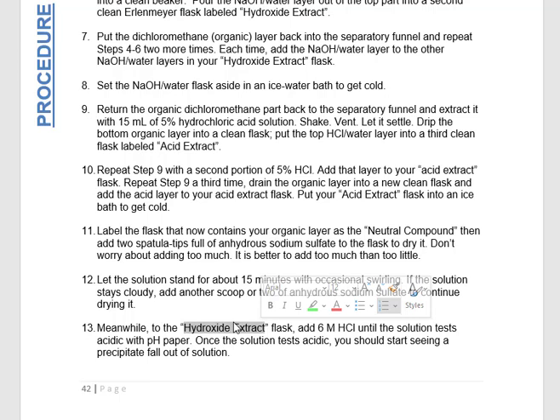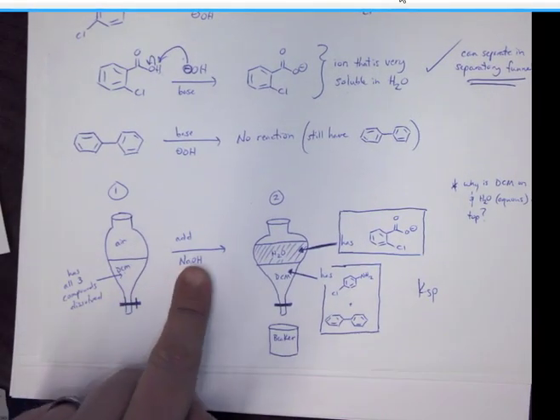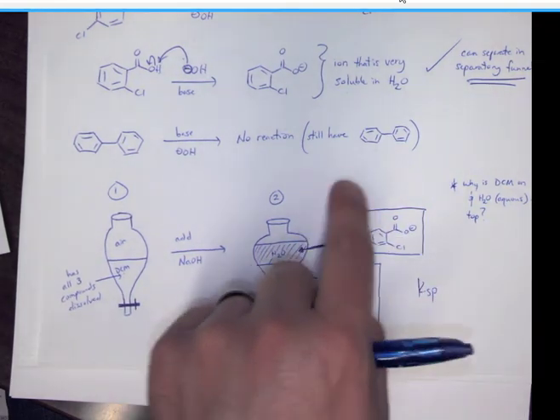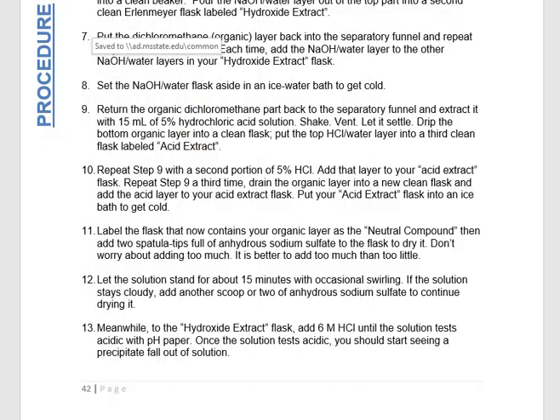What we're saying here for your hydroxide extract, remember in the first step when I showed you here, we took our mixture of all three compounds, we added the sodium hydroxide, and so here you had water, but remember you used sodium hydroxide, so this would be our hydroxide extract. You have your charged acidic species here. So don't get confused by seeing this hydroxide extract and think, oh, that's my basic compound. No, that's your acidic compound.